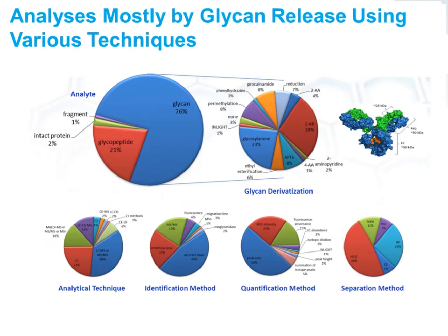And then lastly, you could also use an enzyme such as PNGase F, which is known to clip off N-glycans from the glycoprotein, and you just study the N-glycans in isolation. So 76, or the vast majority of participants in this lab, used this released N-glycan methodology.